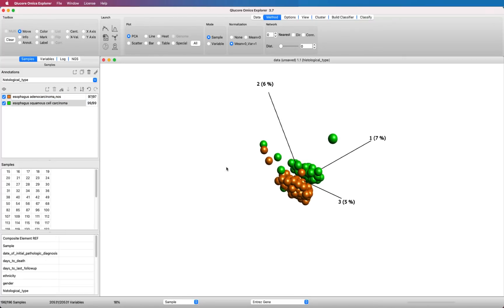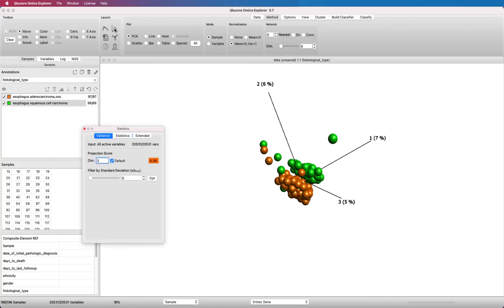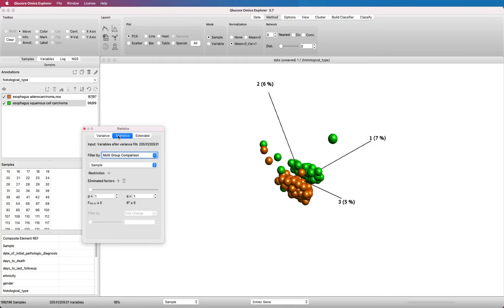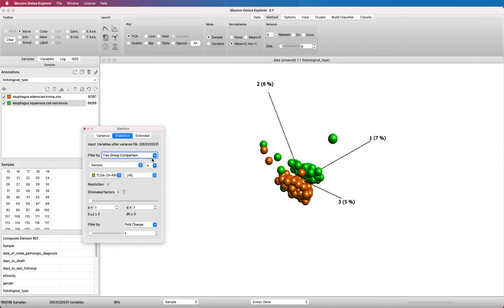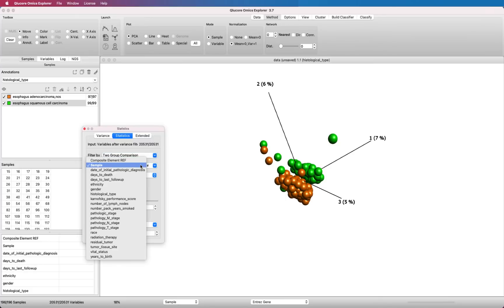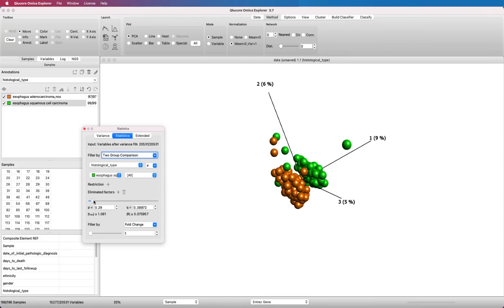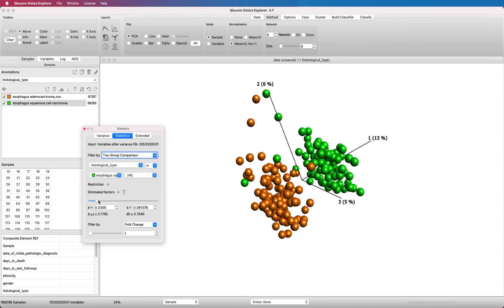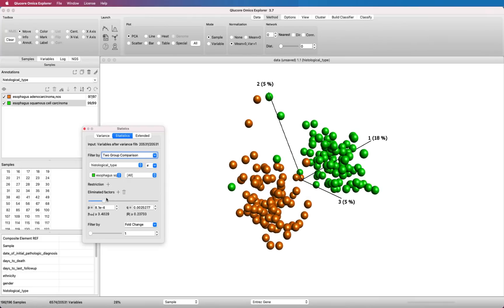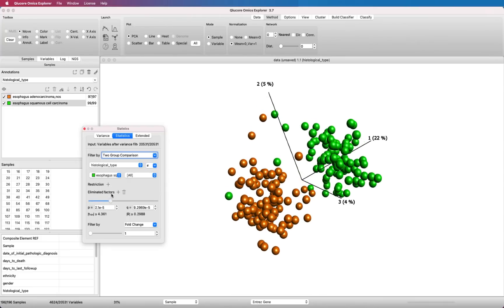And now you are ready to start your analysis. Open the statistical window and define your test. Drag the slider to set the P and Q value cutoff and see how the plot is instantly updated and further separates your two groups.